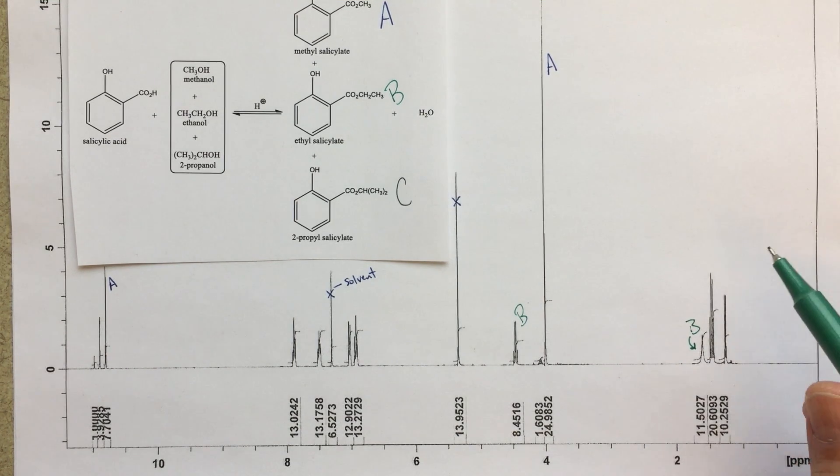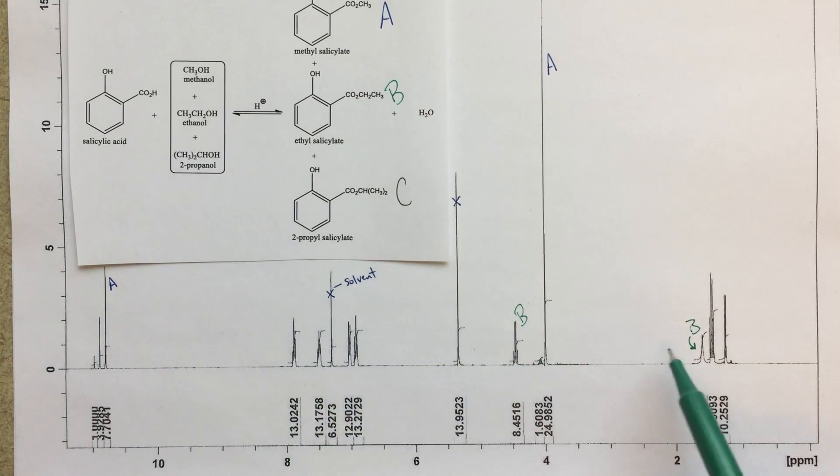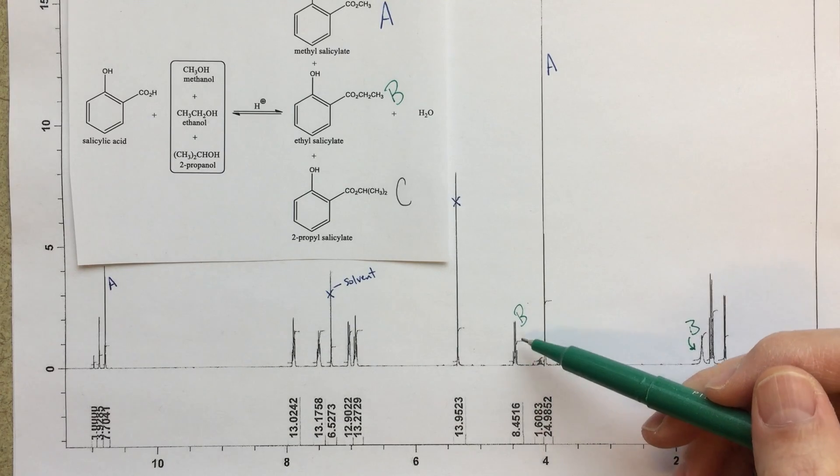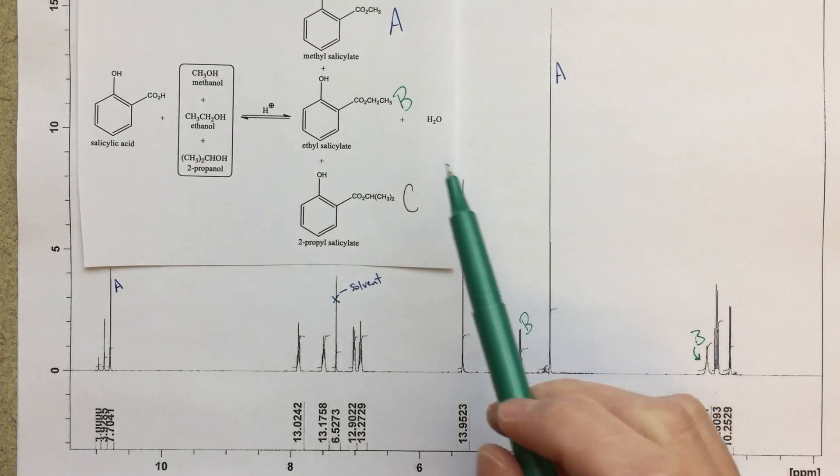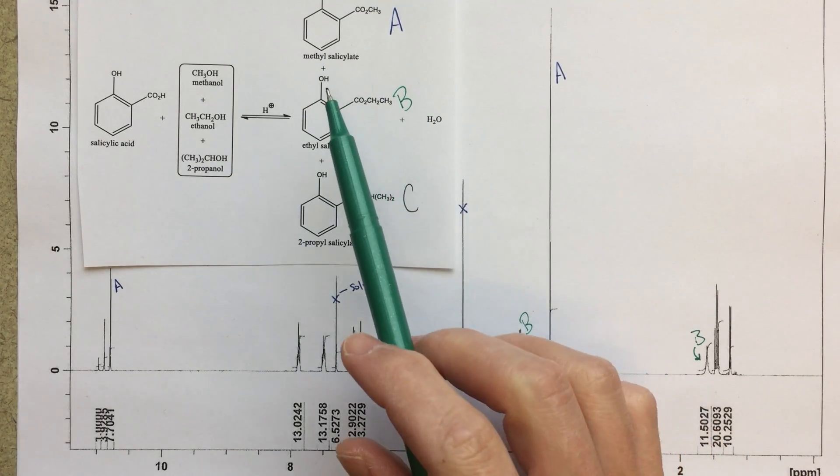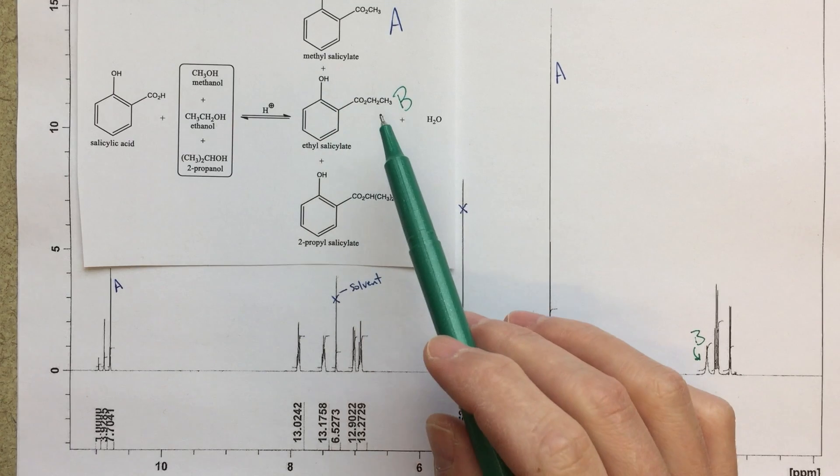Now at this point, again, we could try to figure out or try to decide, well, which of these OH peaks belongs to our ethyl groups? And again, we can look at this integration. So this B peak should integrate to two equivalents, essentially, right? And then because it's a CH2 group. And then the OH should be about half of that, right? If this is a one integration, this should be a two integration.